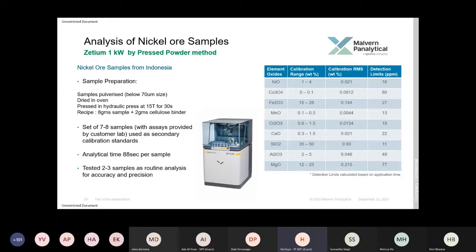Kemudian ini ada beberapa elemen, sekitar 10. Namun hal demikian bergantung nanti dari kebutuhan Bapak Ibu sekalian. Misalnya sekarang ada beberapa tren, SC sangat penting atau scandium penting, nah nanti bisa ditambahkan di situ. Kebetulan ini pakai yang simpel, yang standar. Jadi di sini bisa dilihat dari sisi presisi dan akurasi.